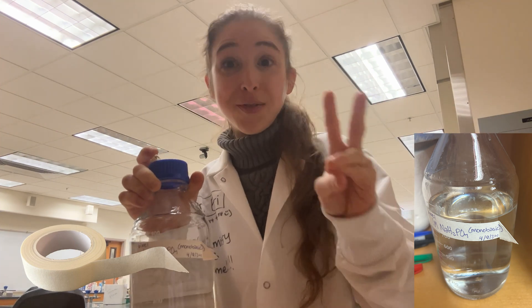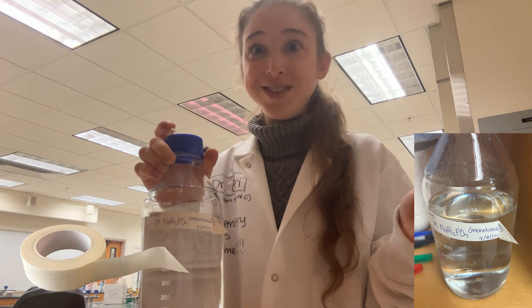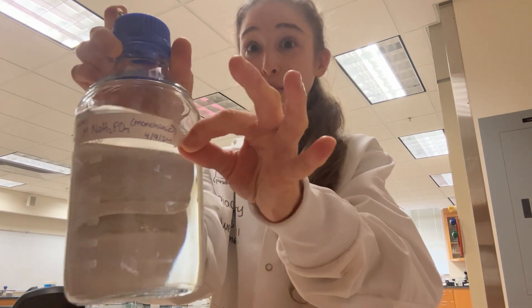It may seem simple, but two of the first and most important things that I teach students in the lab are to label everything and tab your tape.